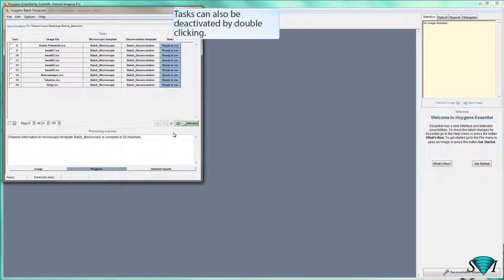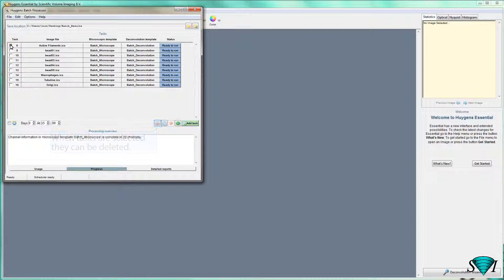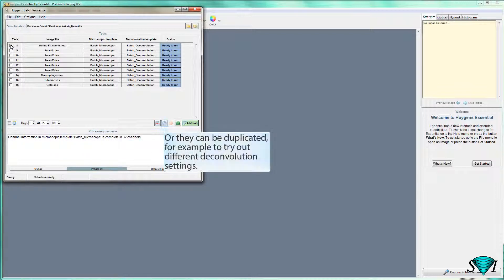Tasks can also be deactivated by double-clicking. When tasks are selected, they can be deleted, or they can be duplicated — for example, to try out different deconvolution settings.